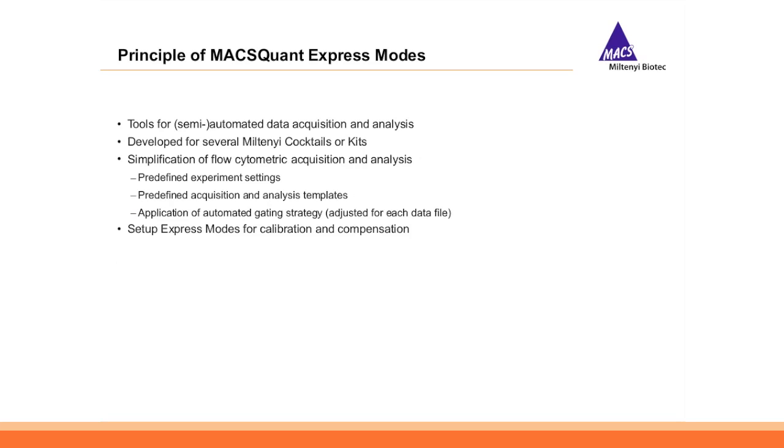Now I want to give you some details regarding the principle of our MACSQuant Express Modes. Those are tools for semi-automated or automated data acquisition and analysis within our MACSQuantify software. We've developed several express modes for several Miltenyi cocktails or kits, and our express modes allow a simplification of flow cytometric data acquisition and analysis by providing predefined experiment settings, predefined acquisition and analysis template, and by application of an automated gating strategy. And this gating strategy is adjusted for each data file.